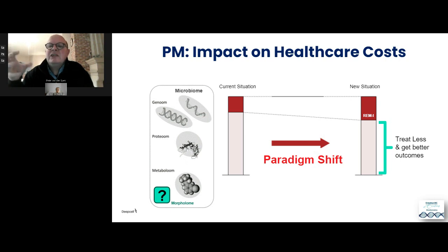So like we studied the immune profile in the T-cell and antibody-mediated rejection, we can collect the same PBMCs and see whether with immunotherapy in a cancer treatment, we are modulating the immune system, yes or no. So you can really get way more quantitative data on your therapy response.